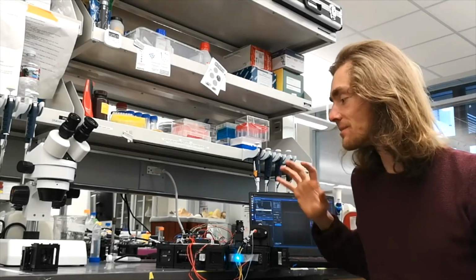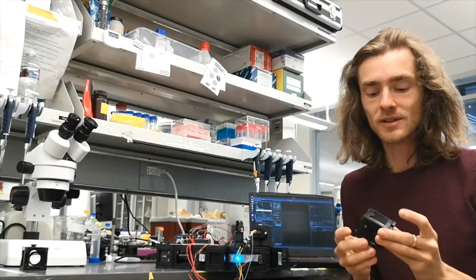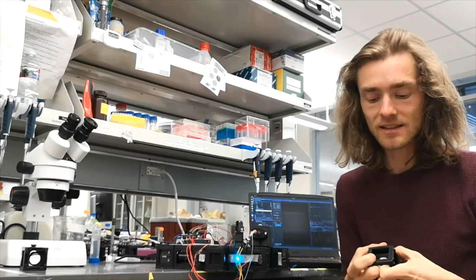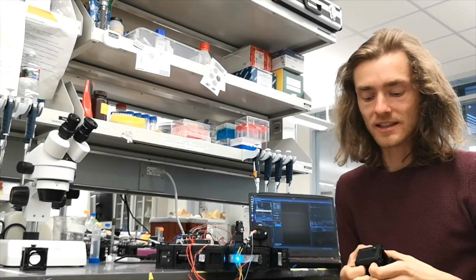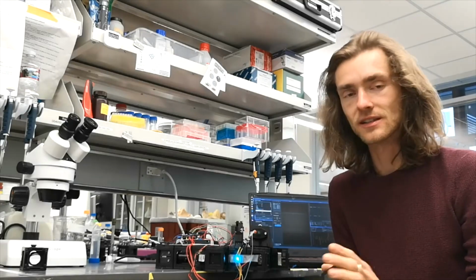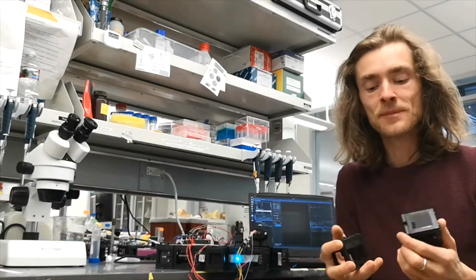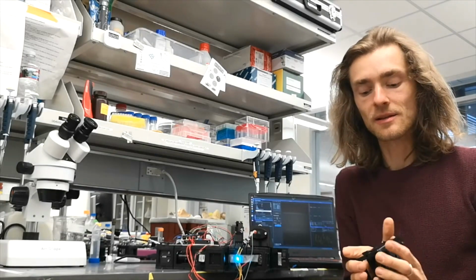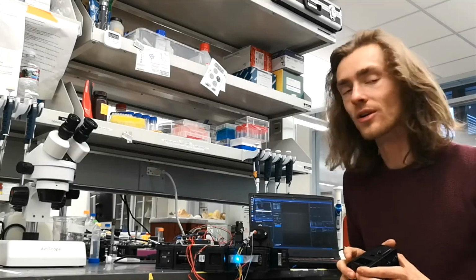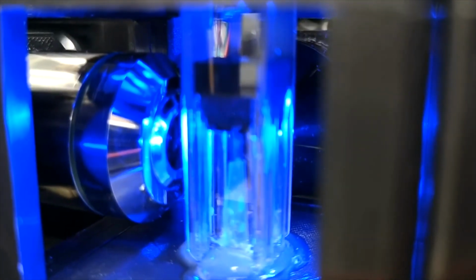What this is built of is mostly these little cubes. The UC2 cube is now injection molded, but you can also 3D print it, and the idea is that you have the function inside the cube. You put them together. For example, here's a kinematic mirror mount, you have lens holders, and you just stack them together, a little bit like Lego, but you can also build much more complicated setups like the holographic light sheet setup.